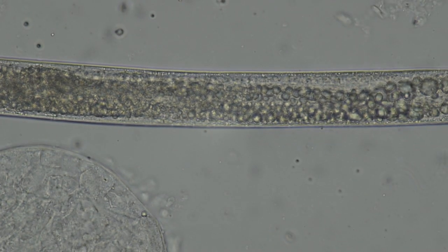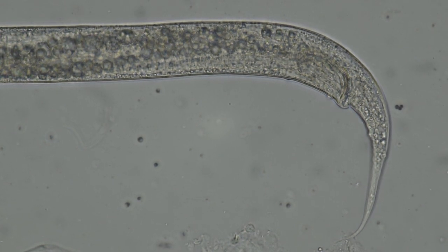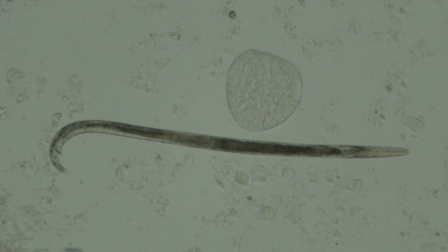Near the posterior end you can see a little bulge. That's the cloaca, out of which the anus and the male gonopore open. Males have a set of copulatory spicules that can be extended out of that opening. Here's another male with a slightly more obvious set of copulatory spicules — they use those to help transfer sperm to females when mating.